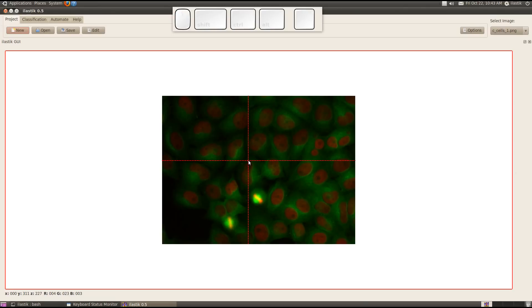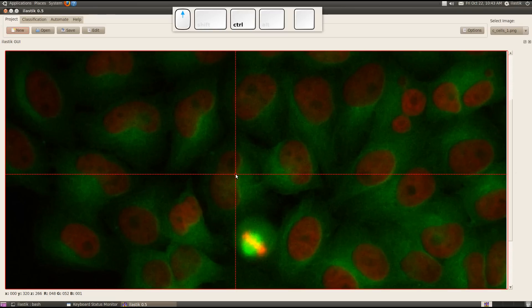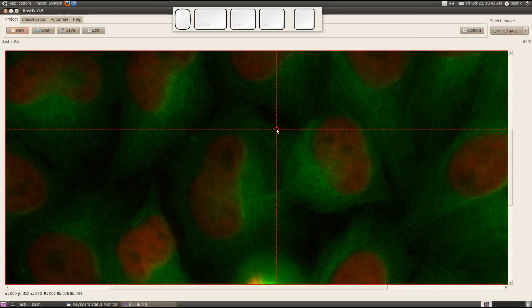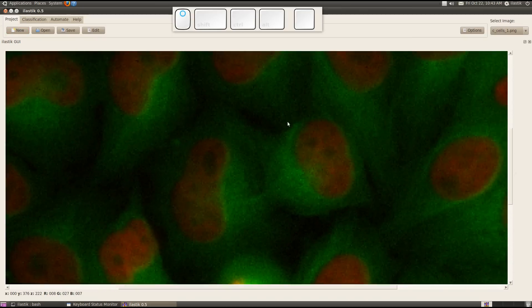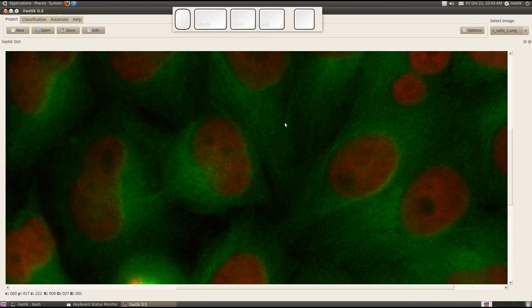To zoom in, you can use the Ctrl key and use your mouse wheel. You can zoom in and then use the mid-mouse button to pan in the images.